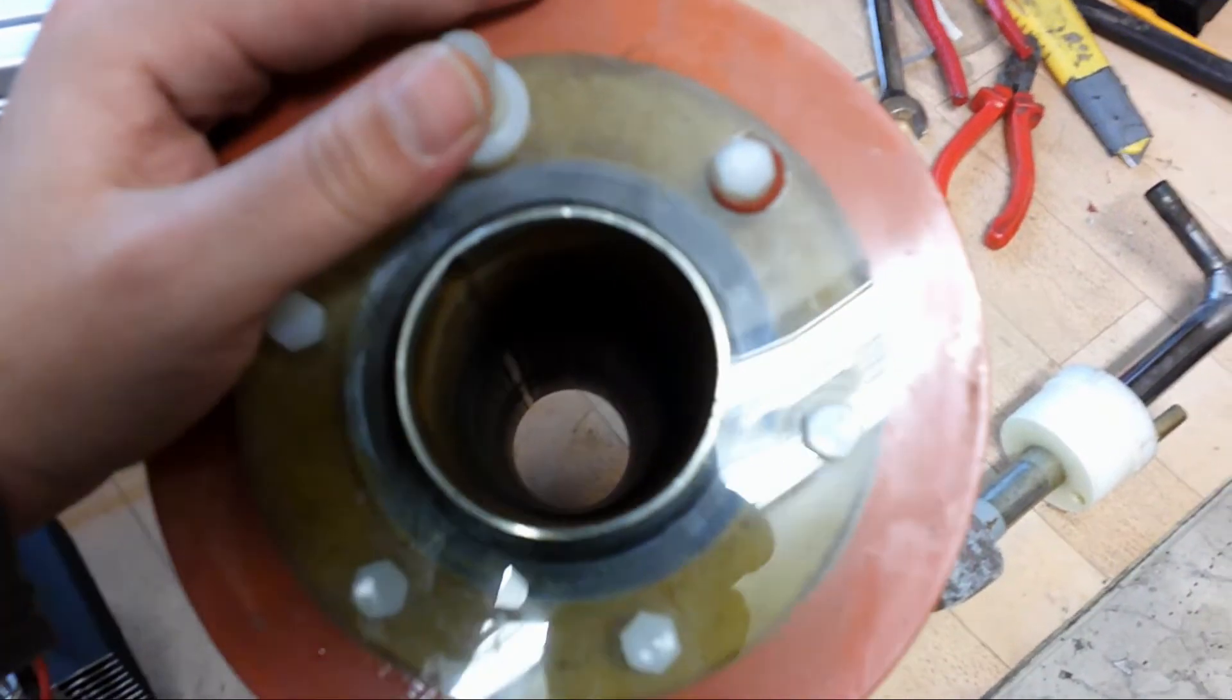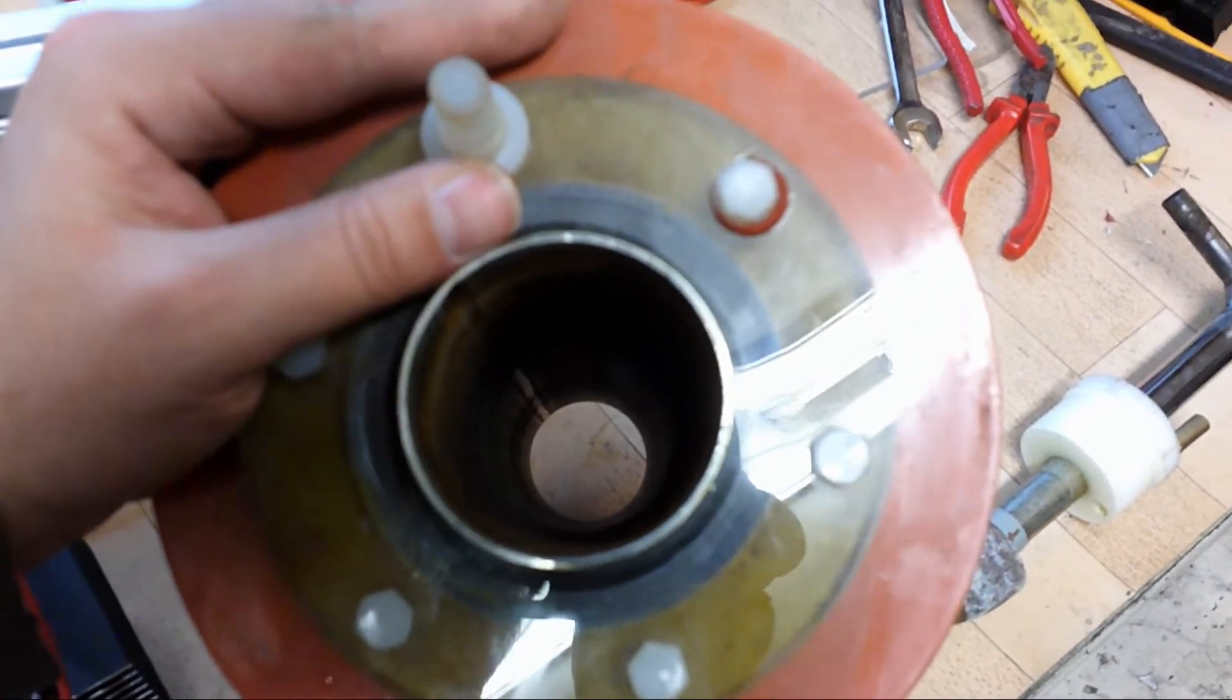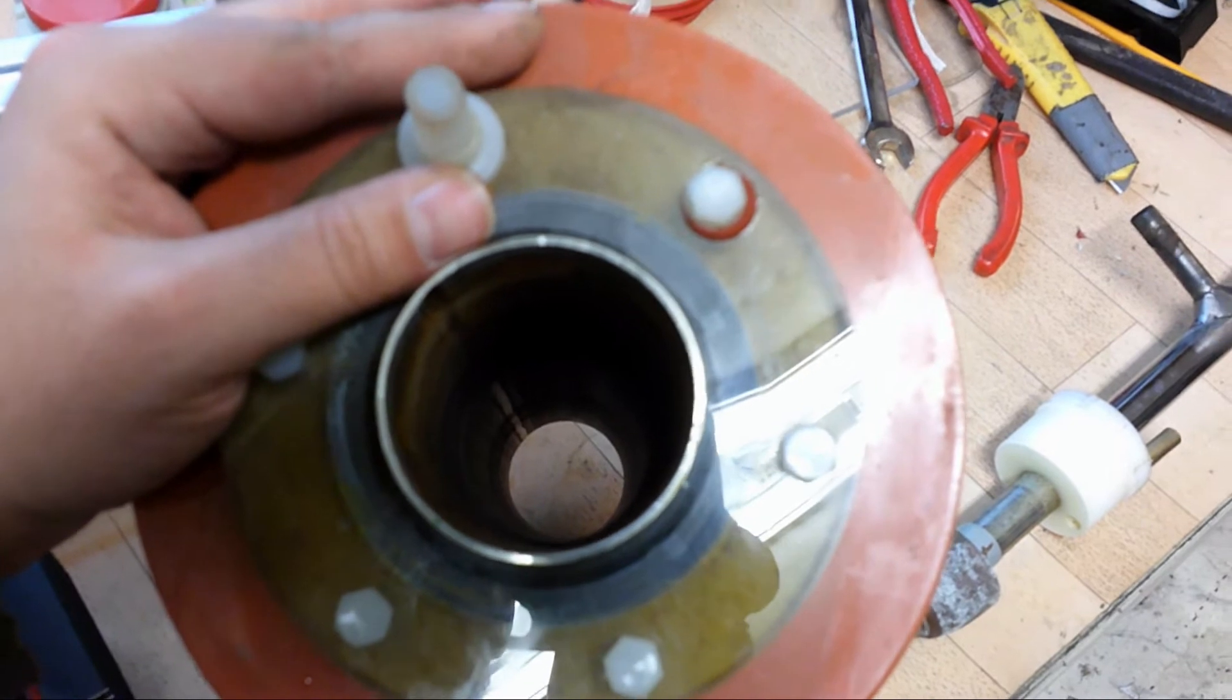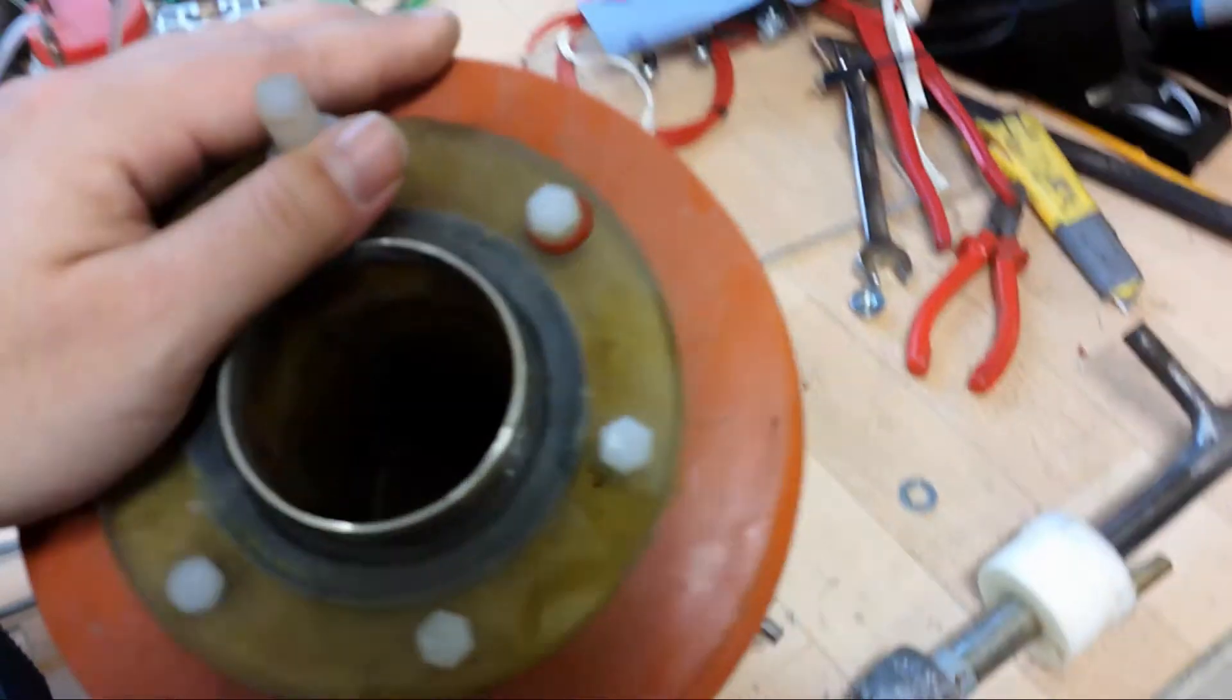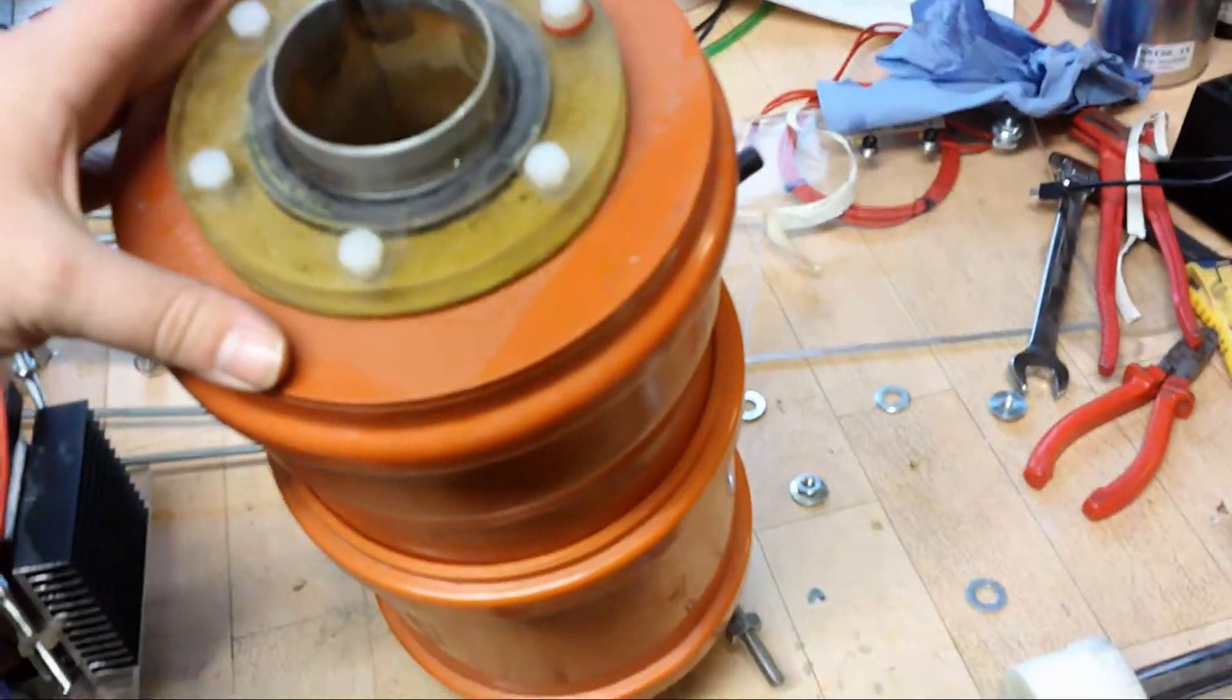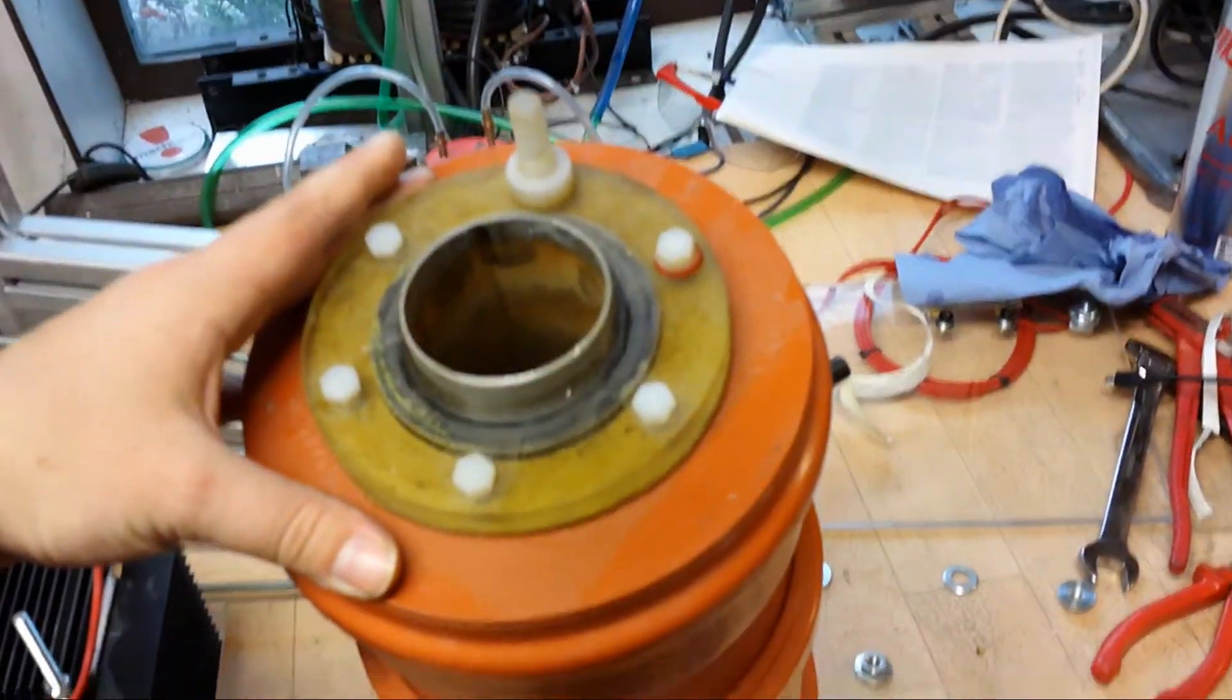As you can see here this is just the outer electrode. It's just a common stainless steel tube, nothing special. And here is the cooling mantle which I will disassemble now.